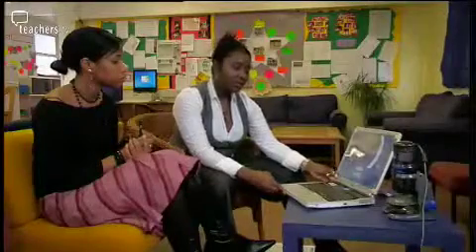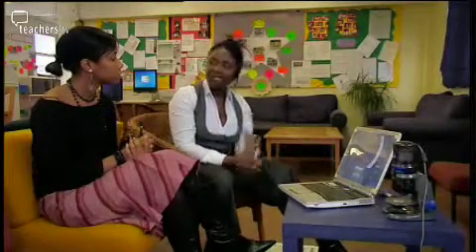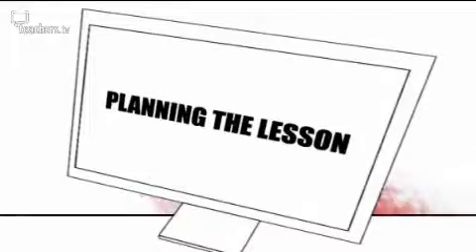You would expect to see some growth within 12 hours. So if we set up the experiment later on this afternoon and leave it overnight, then tomorrow we can actually come back and have a look and see whether anything has grown. I'll have something by then? You should do. Okay. You should do.